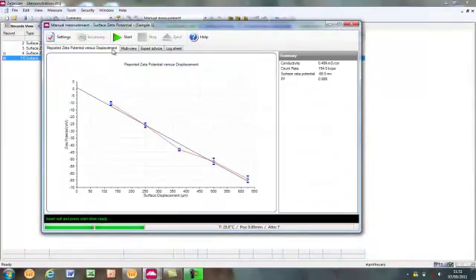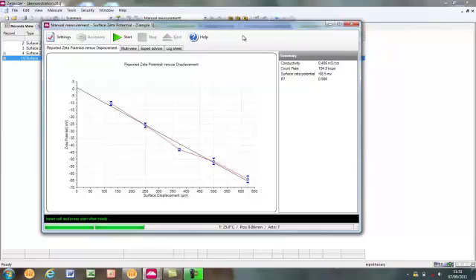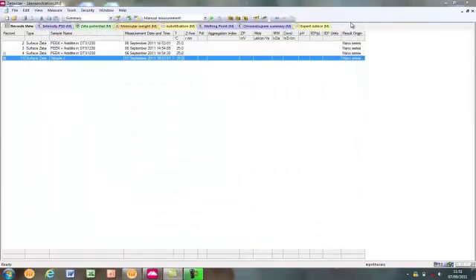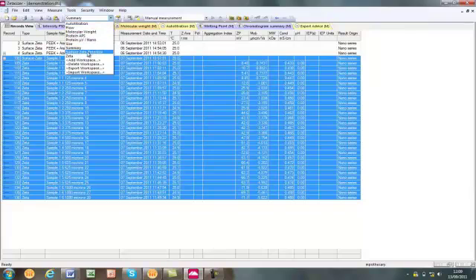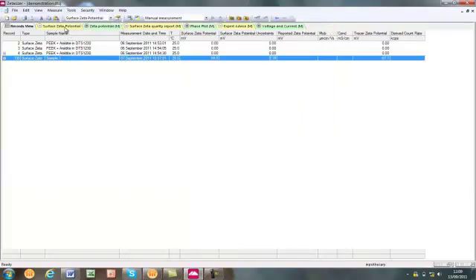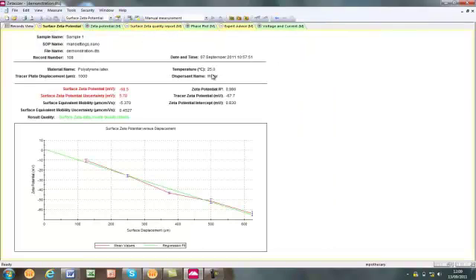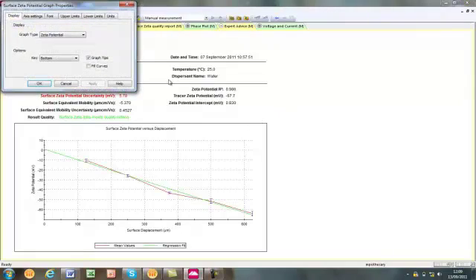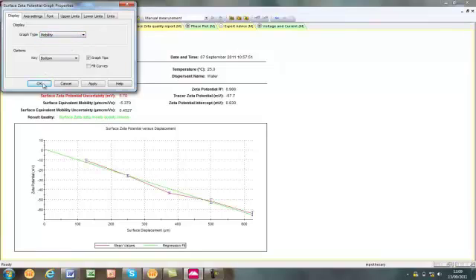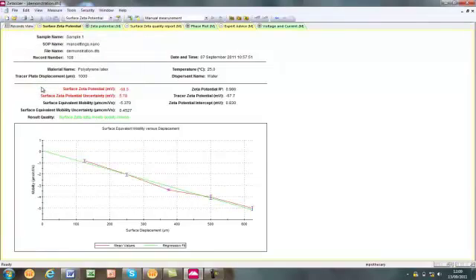When the measurement is finished, the complete displacement plot is visible. Where previously the intercept was displayed, the surface zeta potential is now displayed. When the measurement window is closed, it can be seen that the single parent surface zeta potential record contains all of the individual zeta potential measurements as child records. The surface zeta potential measurement has its own workspace, which can be accessed using the drop-down menu. The surface zeta report page summarizes the result. The surface zeta potential and associated uncertainty and error are both displayed in red and the displacement plot is shown at the bottom. Right-clicking on the displacement plot allows the user to switch from zeta potential to mobility and vice versa.